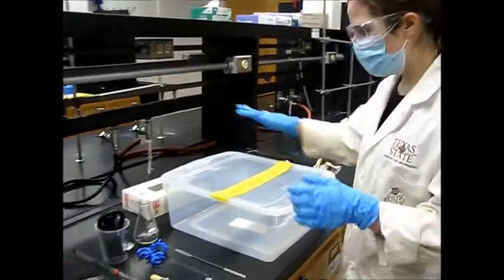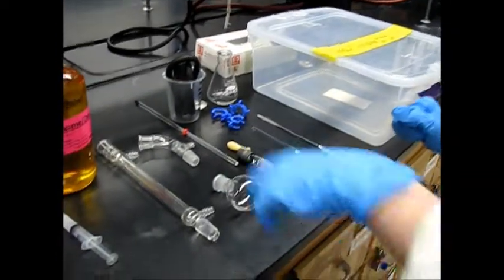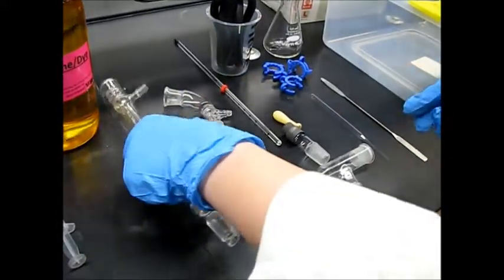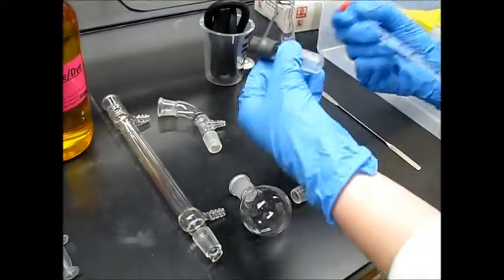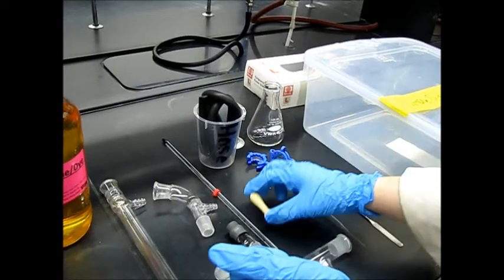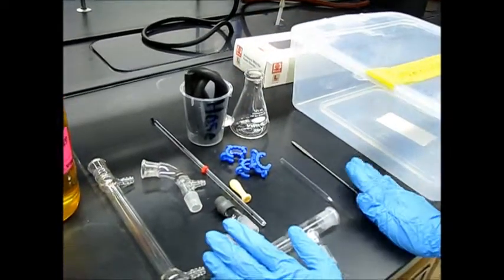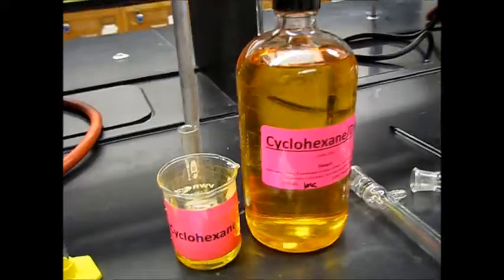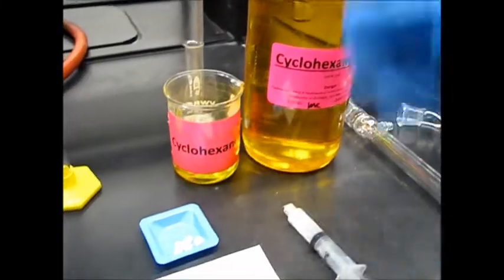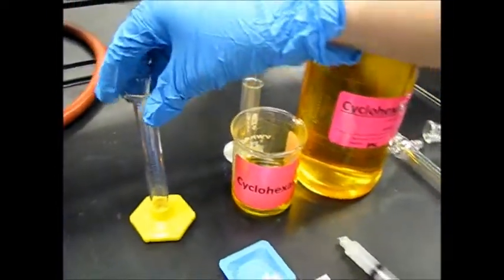Before starting the experiment, you're going to get a bin from the stock room. For this simple distillation, your bin will contain: a round bottom flask, a three-way adapter, a vacuum adapter, a condenser, your thermometer and thermometer adapter, the hose for water going out, an amber bulb, three clips, an Erlenmeyer flask, a spatula, and a graduated cylinder. The reagents for this lab are cyclohexane and dye as a mixed solution, boiling stones, and grease.